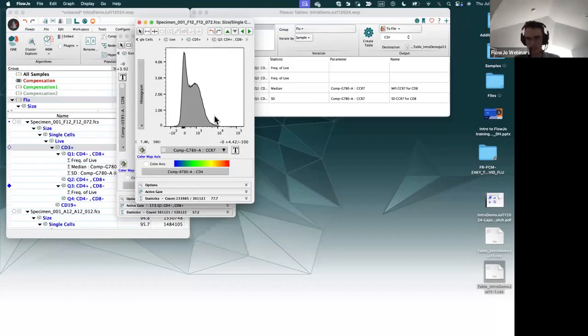The geometric mean is the mean, but it's also accounting for the scaling of the data a little bit. So the logarithmic scaling at least. And so it's a mean calculated in a logarithmic scale. So it's describing the central tendency, but it's taking into account the scaling. It's as if instead of paying attention to the numbers on the axis, we just looked at what bin the data was in. It should be the central tendency of that logarithmic scale.